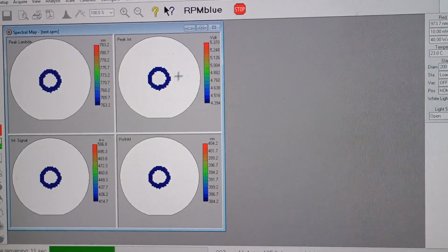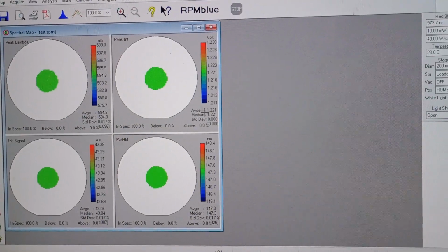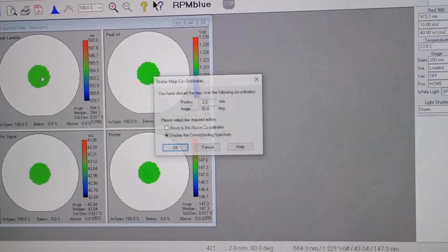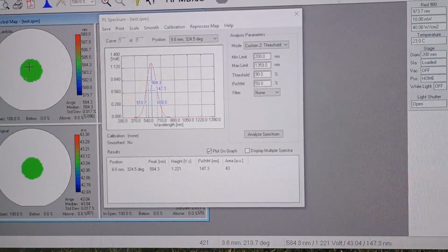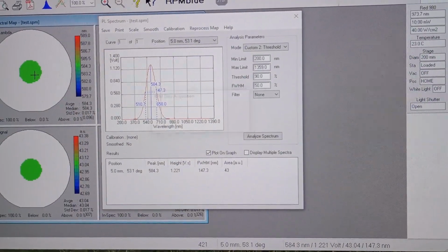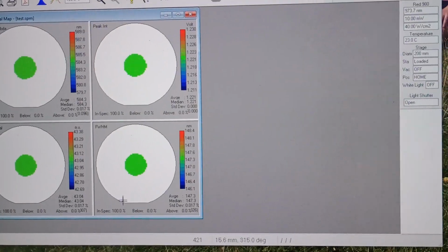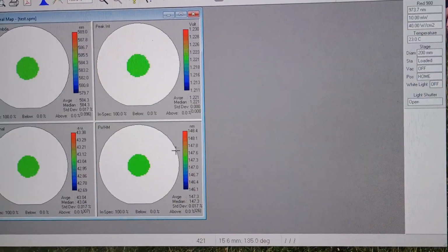So I'll move to the right place, and it all happens very quickly because there's no real instrument attached. So I've got the same thing, and again, I can double click and view what I've got. Okay, so it's exactly the same everywhere, and somehow we have a non-zero standard deviation in that one, but most of the rest are set.